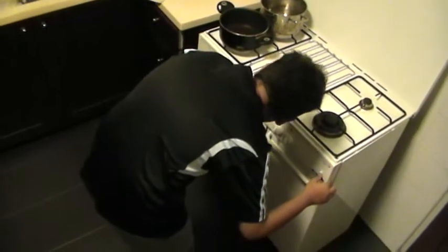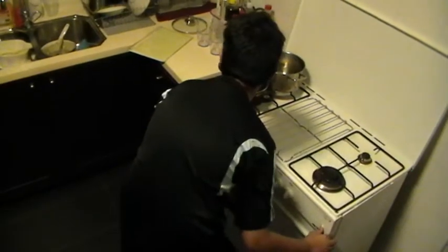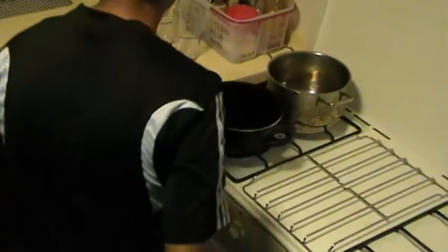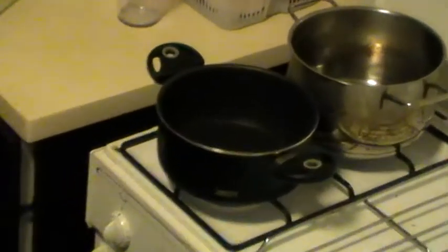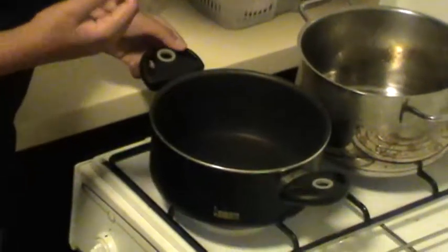I'm going to switch the heat on. The heat has just turned on. And now we just have a look at them. Not much change, a couple of bubbles here and there. So we're gonna start the timer.